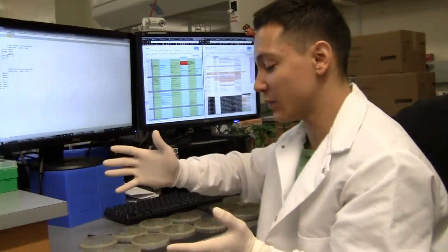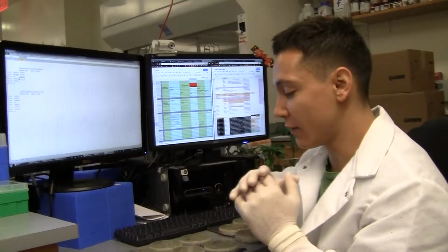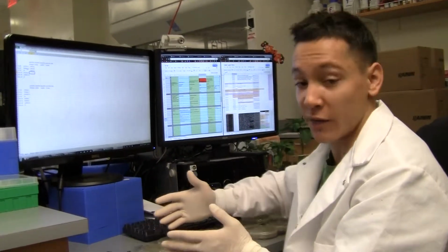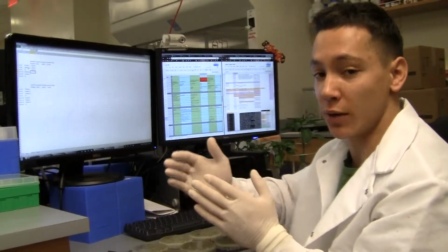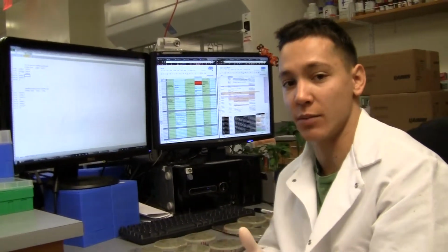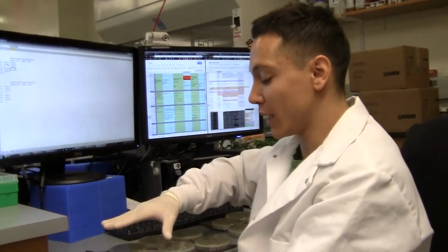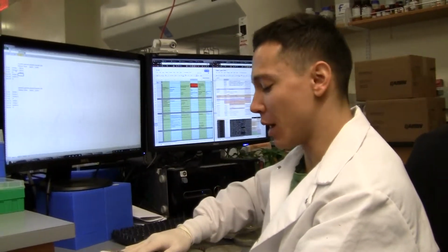And again, that would be the difference between doing an experiment for a publication in which you do a bunch of replicates and everything would be really, really tightly controlled versus a quick experiment. This is a quick experiment to get some new information, to just verify a few things, and to get a sense for how these things compare to one another. I really want to know how these things compare to one another. I don't need to know the exact number of phage in my LV. And also, that would just take too long to do for this video. But it would definitely be something that we could do if we wanted to. And maybe my boss will let me do that.